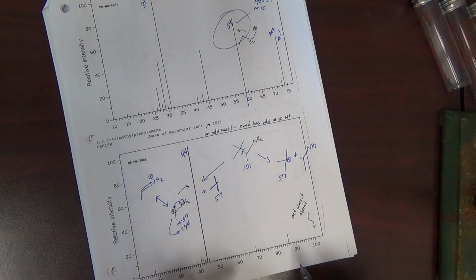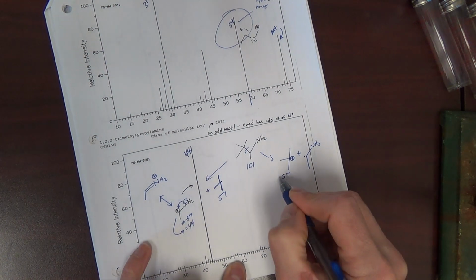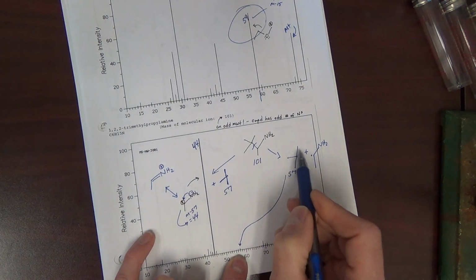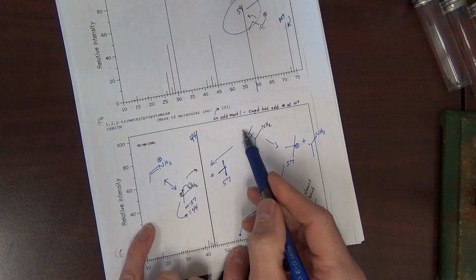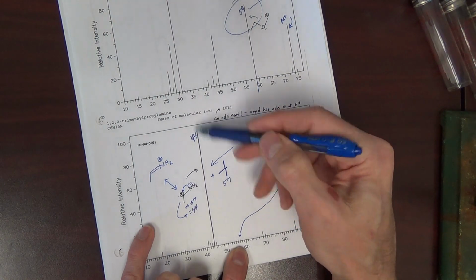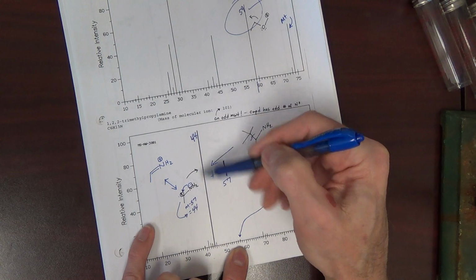Do we have any 57? Very small amount. It's a reasonable cation, tertiary. But apparently the molecule preferred to cleave this way. So many more particles hit the detector and cause more current here. Bigger signal.